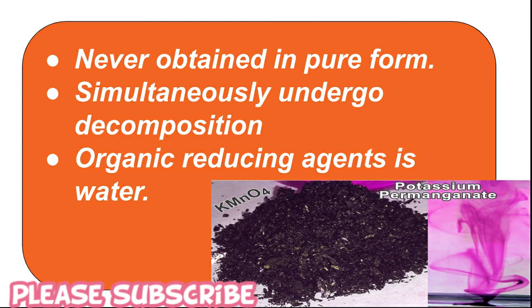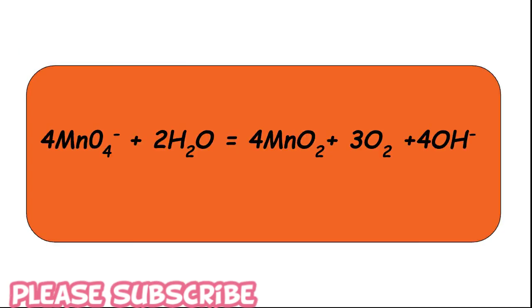As a result, its strength changes, and the presence of MnO2 is very dangerous as it catalyzes the decomposition of KMnO4 on keeping. Here is the equation which shows the decomposition of MnO4 minus into MnO2.